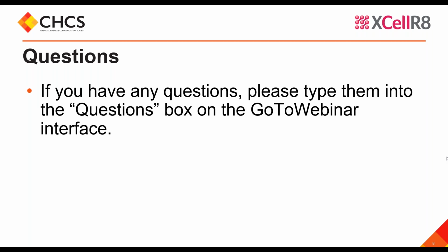Okay. And another question, would Test Guideline 435, the membrane barrier test, be suitable for mixtures as well as substances with pH extreme, or is this too difficult to predict? No, it is actually suitable for mixtures as well. So as long as the pHs fall within the acceptable range for the test and that the changes can be predicted, it's okay to use it for mixtures.